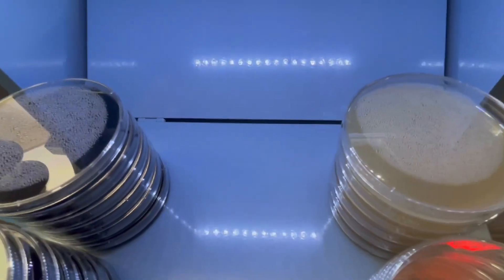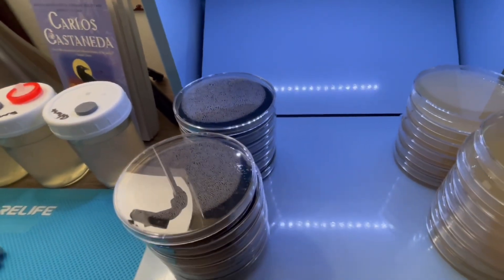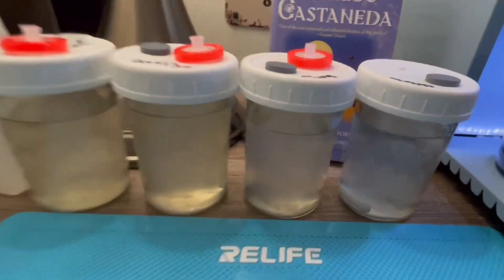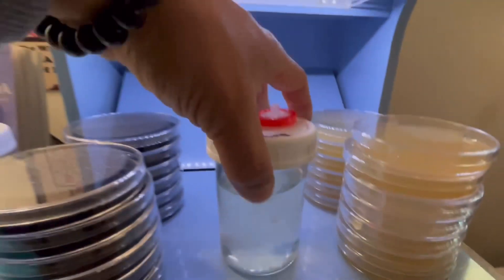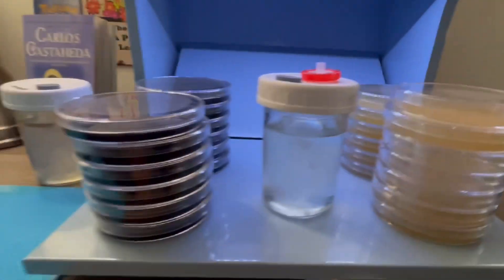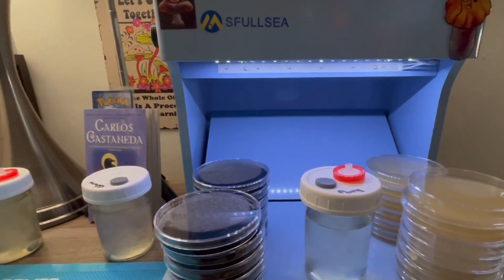This thing works great. I've done about 200 plates, about three or four were contaminated — and I don't even think it was the flow hood's fault, just lack of sterility. Works great, done my liquid culture on it, all my agar work. The size is perfect, kind of just tilts down a little, so when you're pouring you want it leveled out — I just put this little top right there.